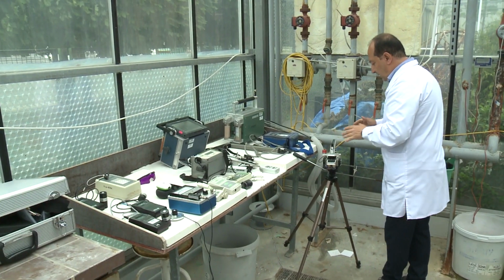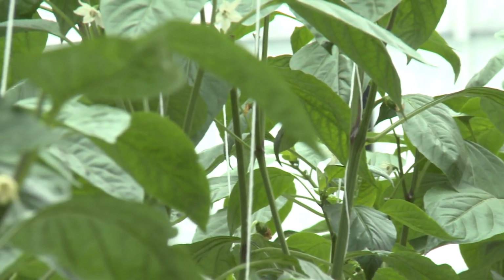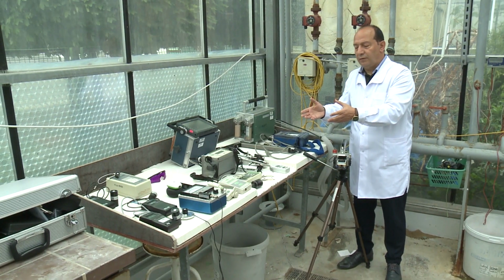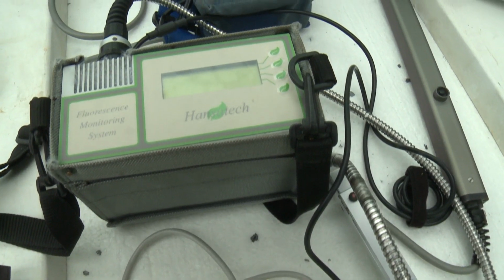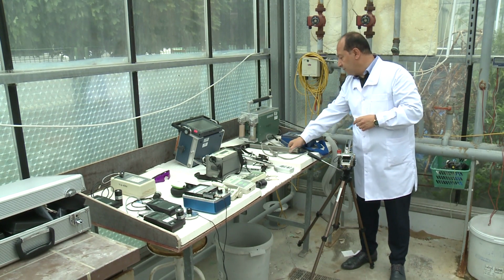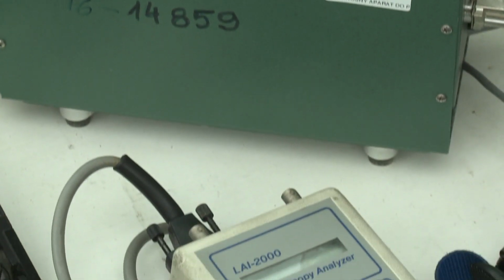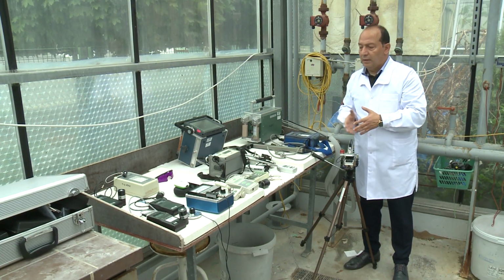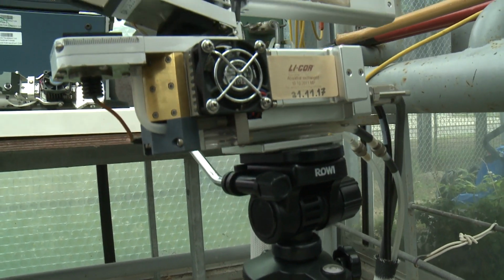The last instruments show the effect of all these processes which could be measured by the other instruments, and they are all designed to help understand the photosynthetic productivity and efficiency of the plants. So you can see that in the leaf area measurements and the architecture of the plants. For these purposes, we have a plant canopy analyzer, which gives us the ability to analyze the architecture of the plants and then measure the leaf area, which is a result of higher or lower photosynthetic productivity and efficiency of the plants.